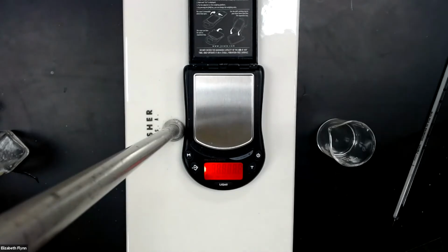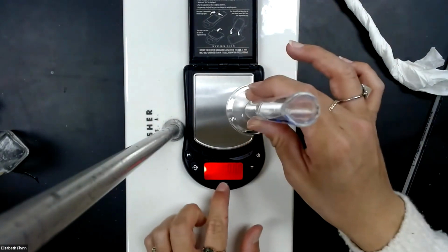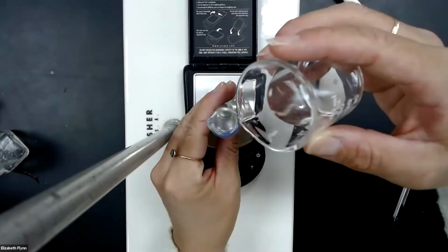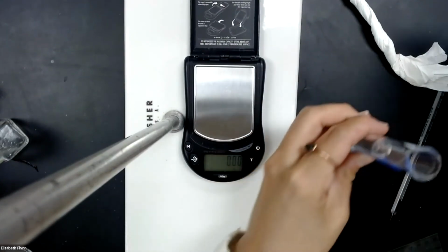And I've got a little bit of debris on my scale, my balance. I'm going to wipe it off a little bit. All right, so we've got it on 0. Turn off the light so you can see. I got my empty graduated cylinder again. And this is for part 3, trial 1. So empty, 34.68 grams. And then we're going to add about 9 milliliters of the saline solution that you just made. We'll bring this down so we can read the volume.